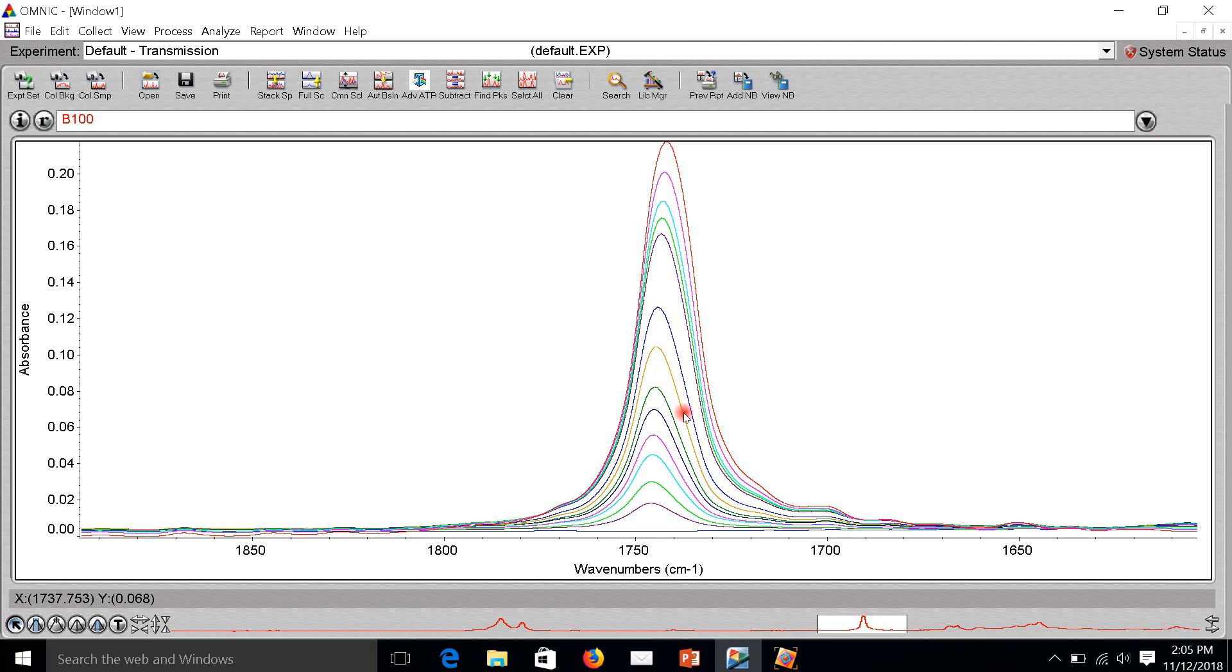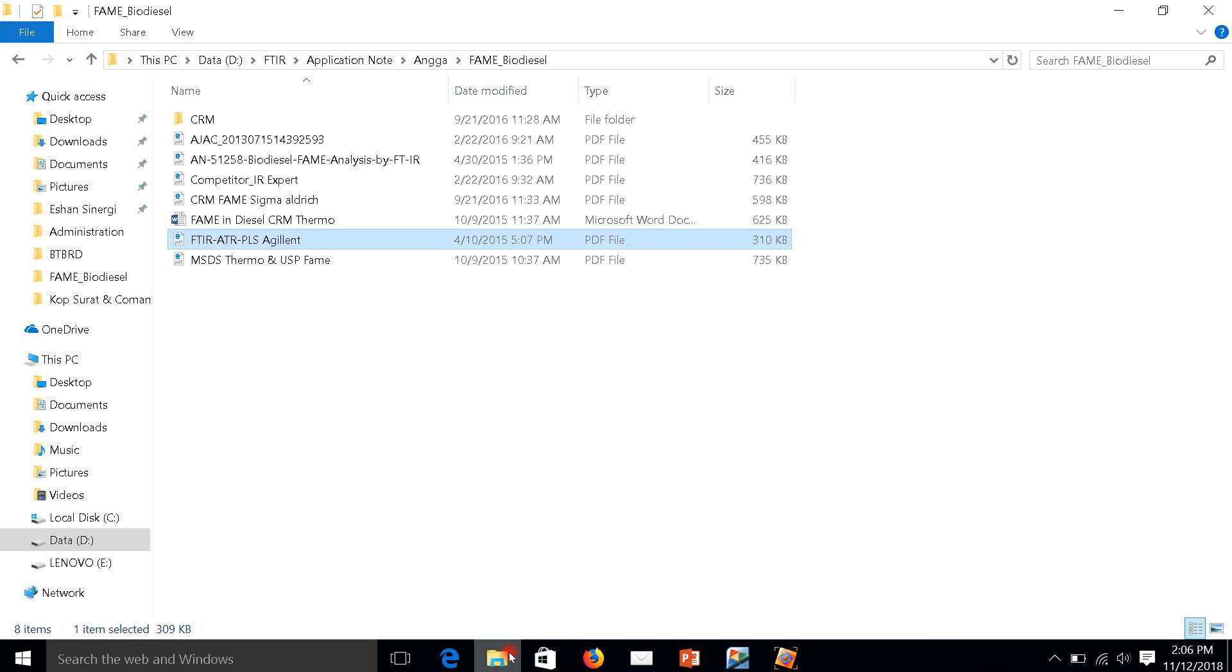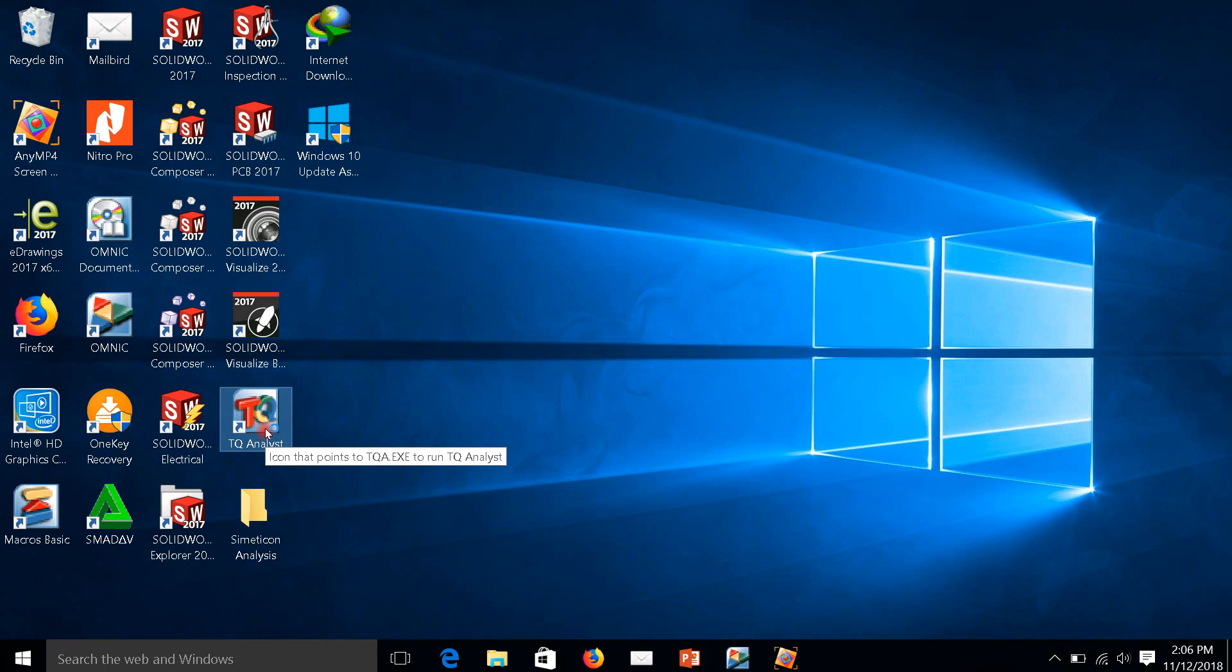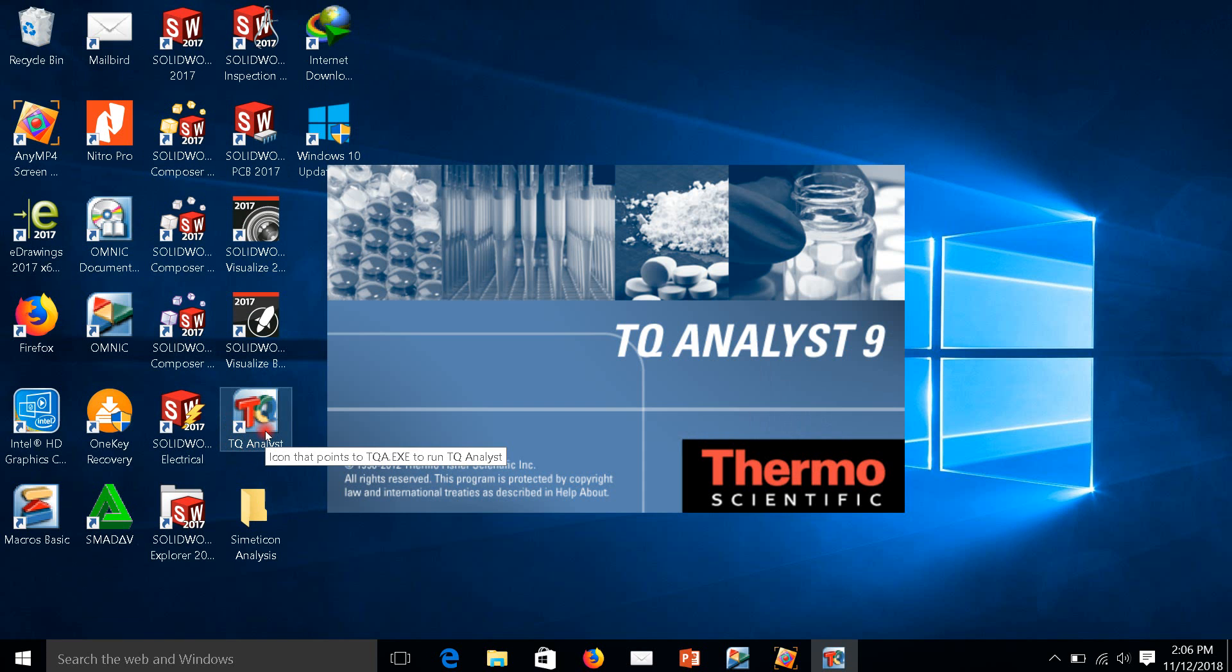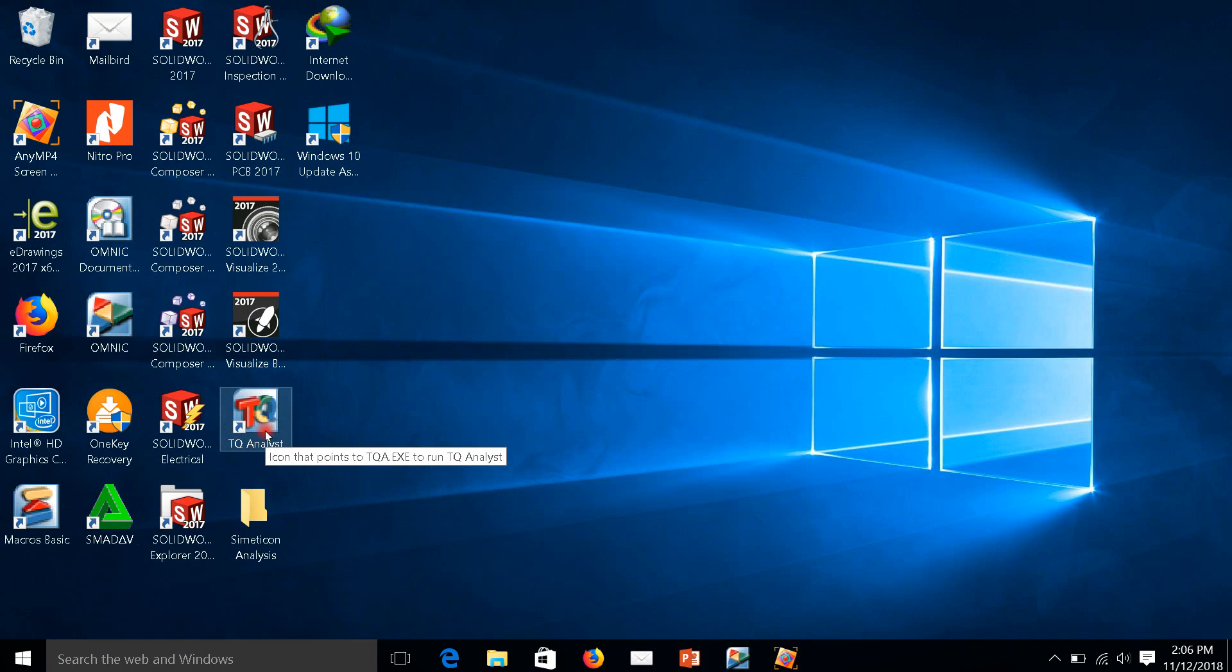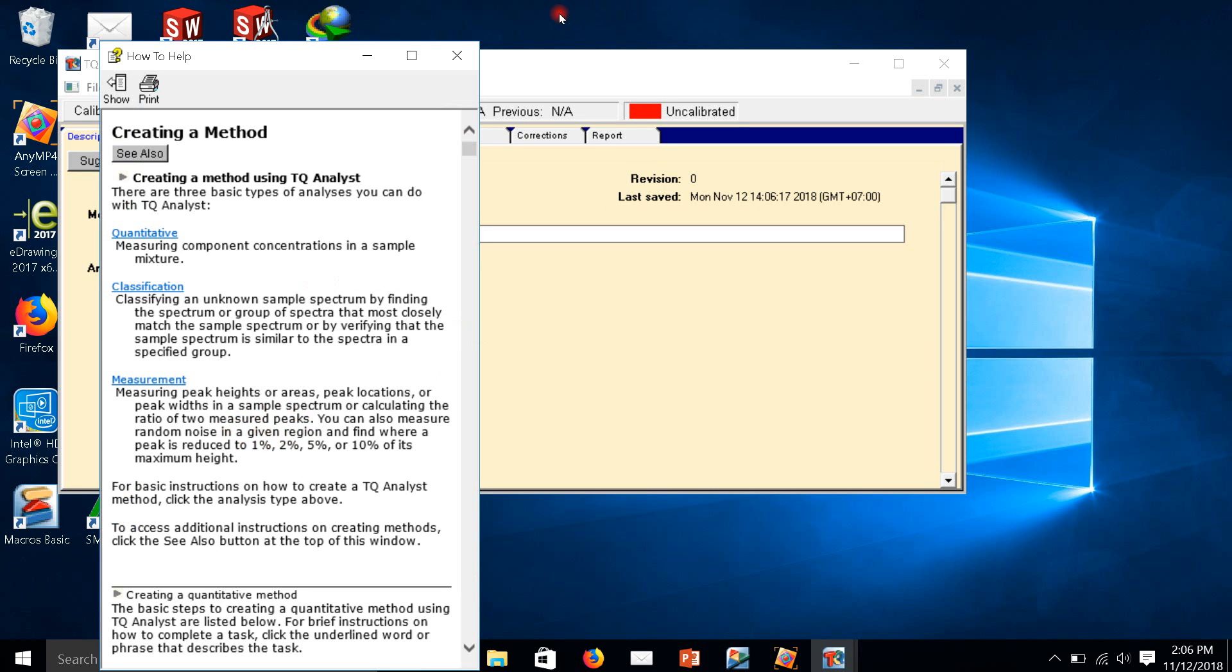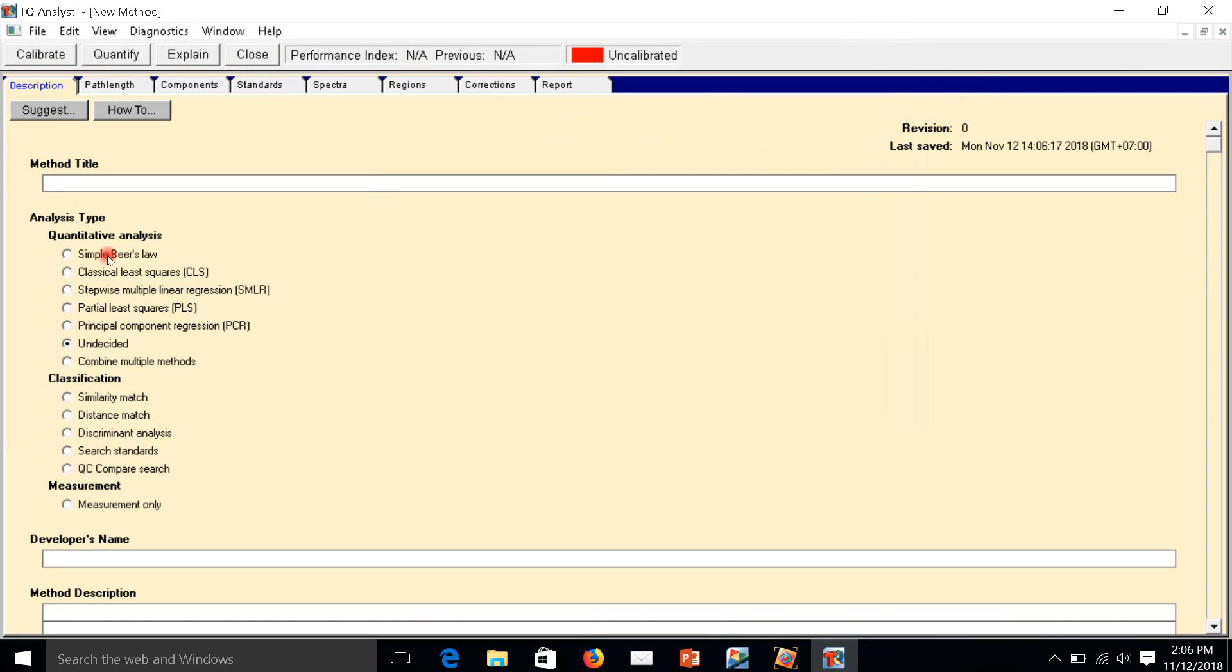I already have all the spectra to make the calibration method, so I need more software. We call it TQ Analyzer. TQ Analyzer is a method builder. This software is designed for Thermo FTIR.